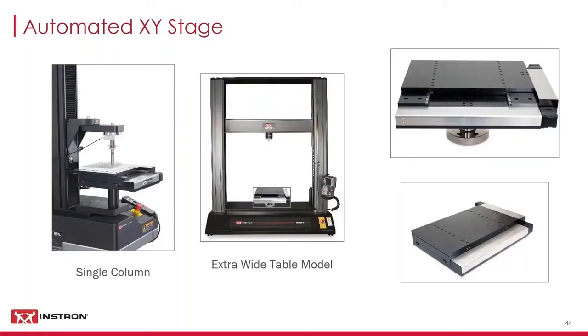Many of the photos we'll look at in the application slides show individual tests being run manually, but it's possible to run all of these and many others with an XY system. It all comes down to having the right fixturing to support multiple specimens or the component.